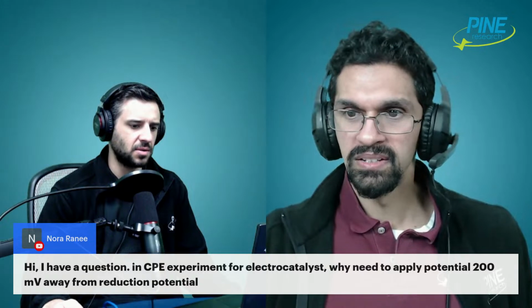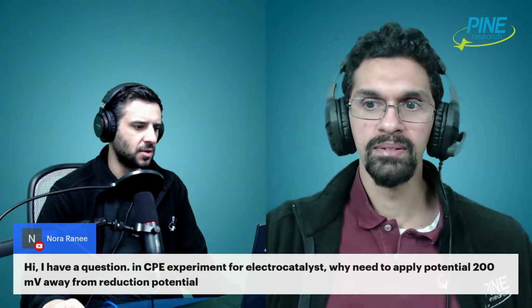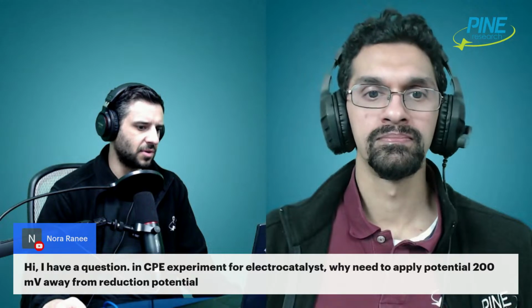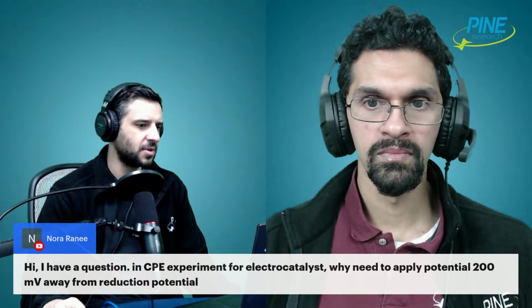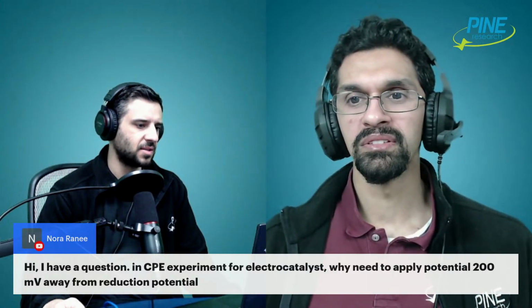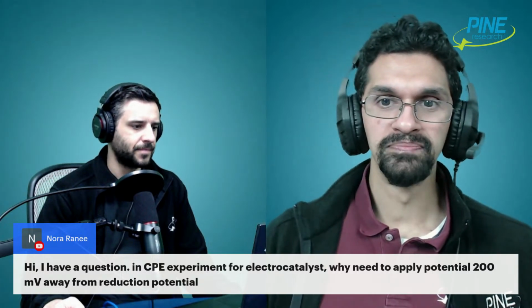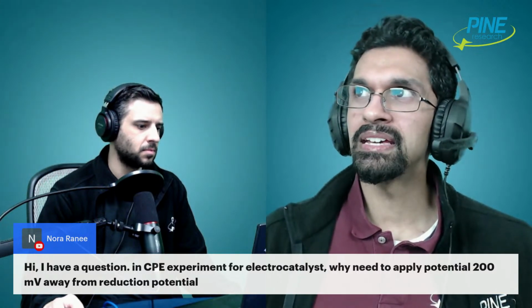But it looks like Nora has a follow-up. I'm not sure if this is the same question you just answered, or a similar one. In a CPE experiment for electrocatalysis, why do we need to apply 200 millivolts away from the reduction potential? Well, this is a specific one, probably related to irreversibility. When you say away from the reduction potential, I'm assuming you mean more negative of the reduction potential, and that can be.